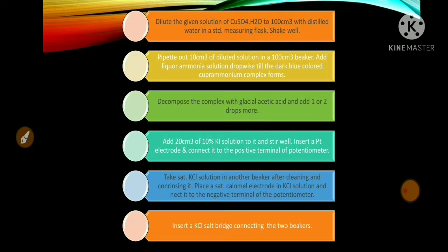Insert a KCl salt bridge connecting the two beakers. Then add 0.5 cm³ of sodium thiosulphate solution from the burette into the beaker containing copper sulphate solution along with liquor ammonia, acetic acid, and 10% KI solution. Measure the EMF reading from the potentiometer.